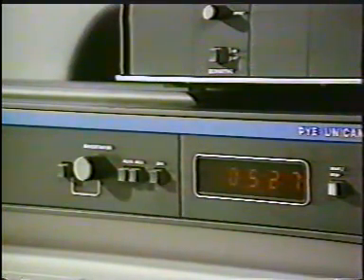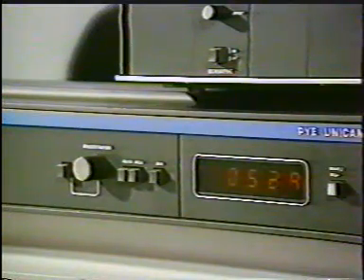Let's summarize what we have said about raw materials. A set of standards is drawn up. This includes a description of the substance, tests for identity, carried out on every container. The tests may be chemical or determination of physical constants. Determination of physical constants as indicators of purity. Quantitative assay, limit tests for small amounts of impurities.